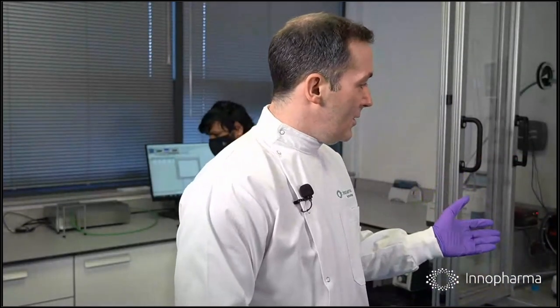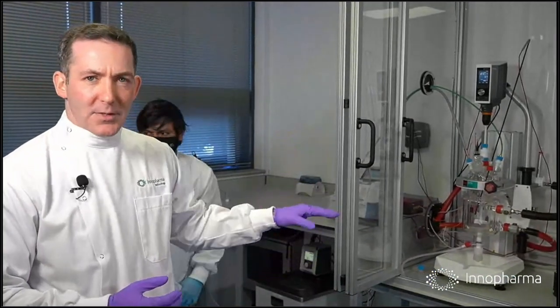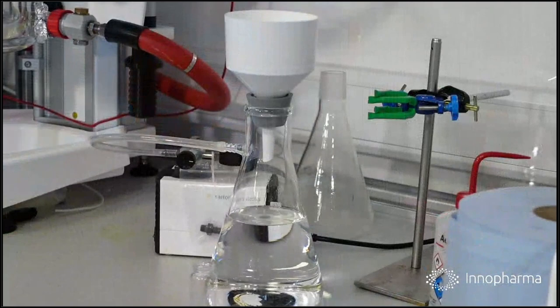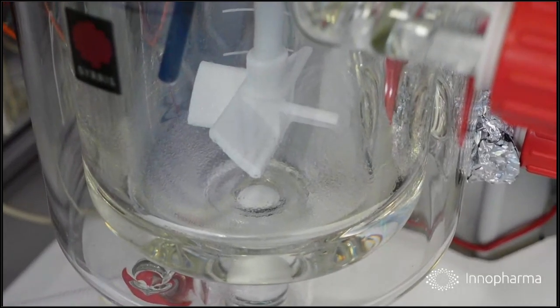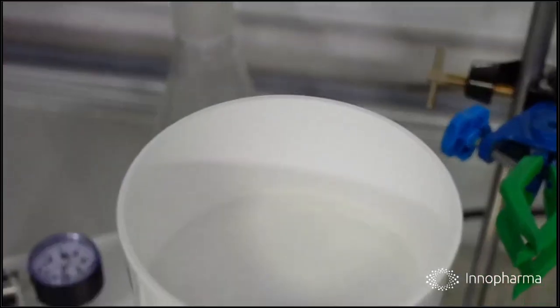Okay, so you saw the solution being transferred. We could take more time, wash out the reaction vessel to transfer more of those crystals from the base of the reactor. But we want to use this as an approximate method. So we will give you a quick and dirty measure of the yield. Yeah, you can see, so thank you, Chris. You can see some of the crystals are still present at the bottom of the reaction vessel, but the point will be the same.